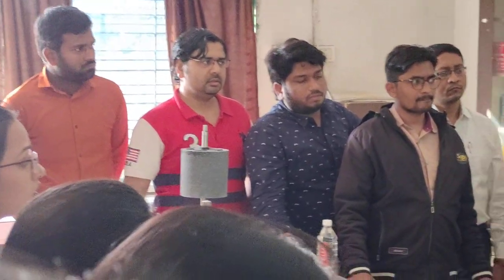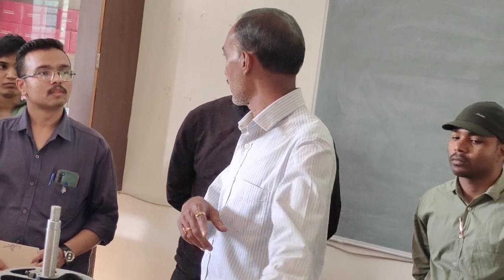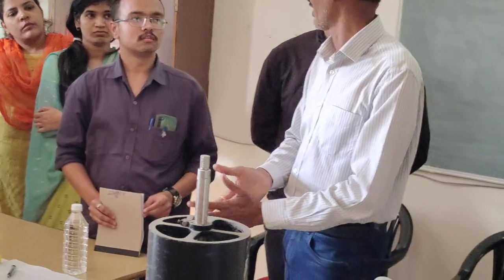So how is handling done in case of medical imaging? Medical imaging, suppose we have to monitor tumor spheroid formation in them. So how can we monitor this through a microscope? Suppose we have given some radiation. That's why your gamma imaging is there. A gamma camera will be there. The animal will be anesthetized and placed on the gamma camera, and you will take the snap. There is no need to hold the animal.